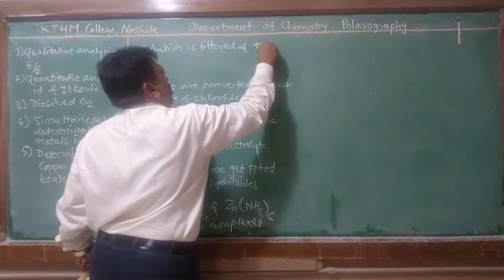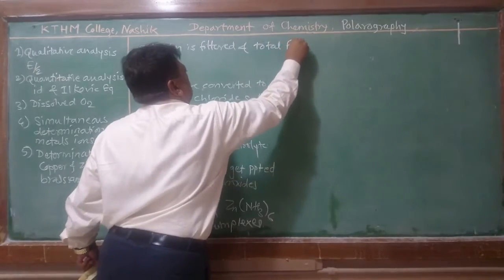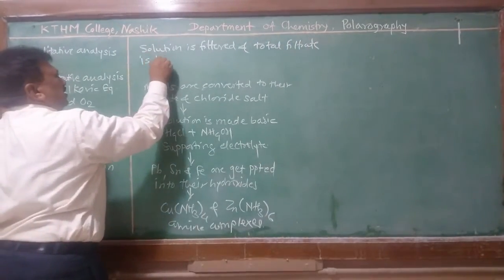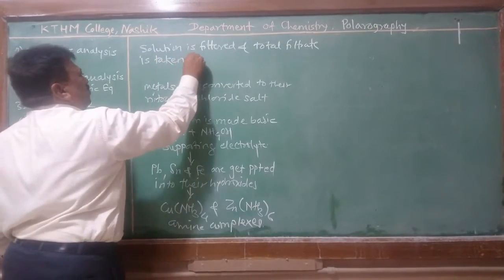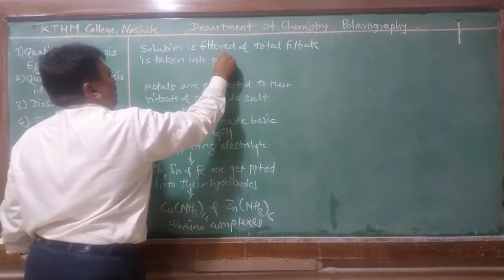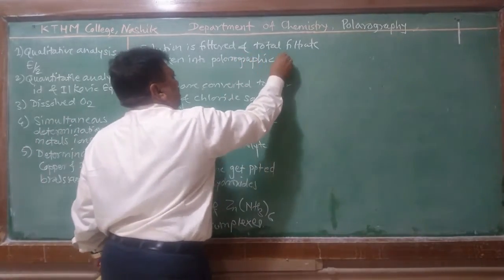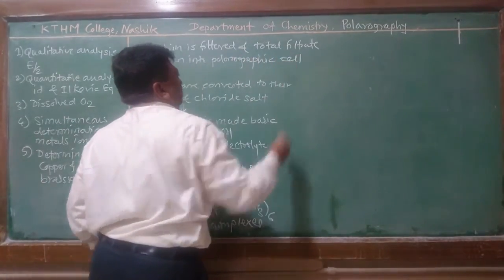The total filtrate is taken into a polarographic cell.